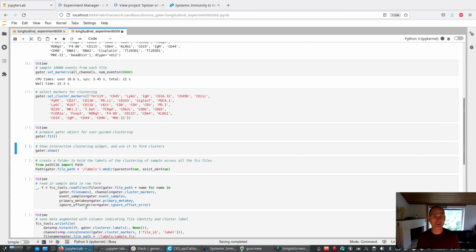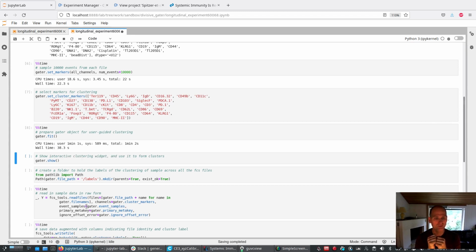This is also going to take a little while, so I will just let you wait while it's processing. The method is kind of what we've been talking about in the cytof meetings at the hospital. It's a variation of single linkage clustering that can cope with pretty large amounts of data. What is happening now is that I have sorted the events so that similar events are next to each other.